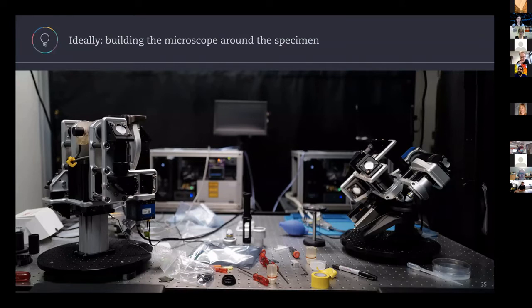And the other thing you recognize here in the back are these electronic boxes. And so we found a way to put everything we need in addition to the optomechanics and the optics into a single aluminum frame. And so essentially the entire microscope consists just of the optics and the electronics part. And this also includes, you may recognize the Toptica laser engine with 4 laser lines to feed the laser light to the microscope.